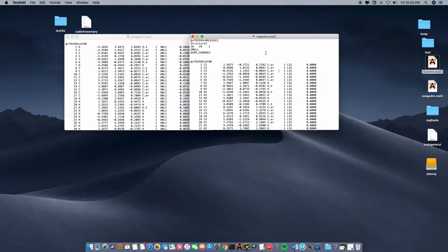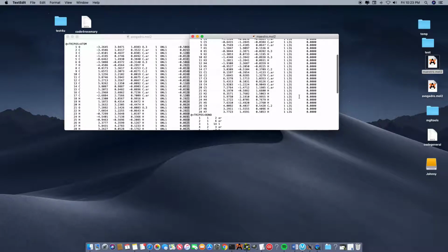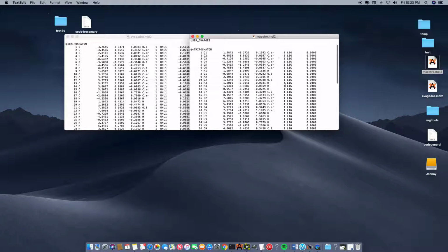So it's annoying, but Maestro is a great way of organizing this in such a fashion that it can be read by other programs. It does this very well, and it adds this addition here, as well as a res ID number.